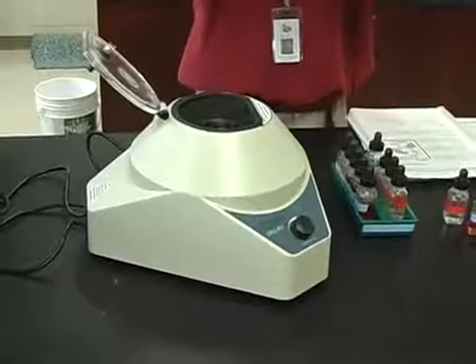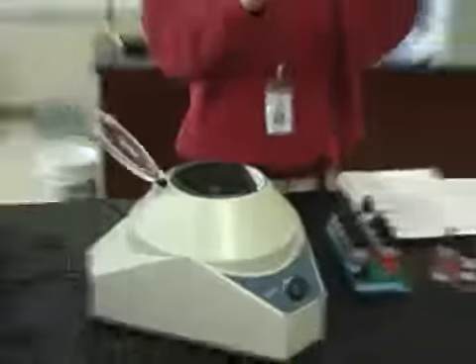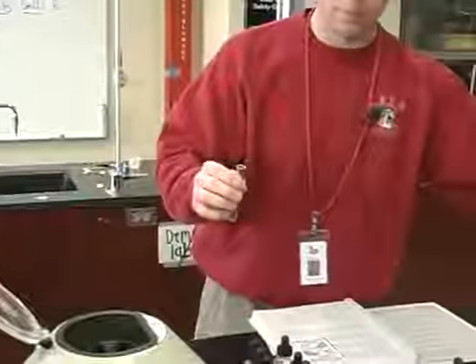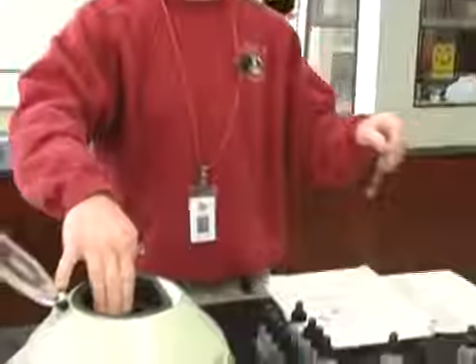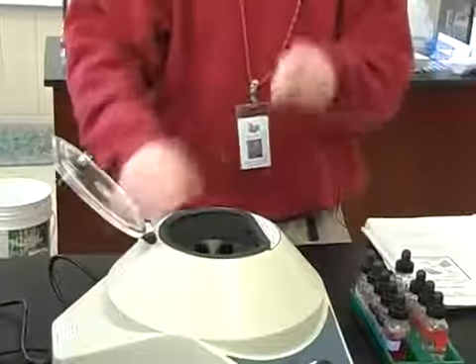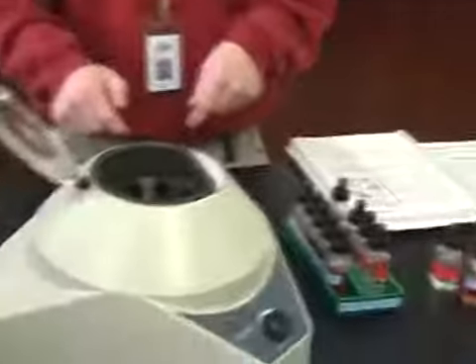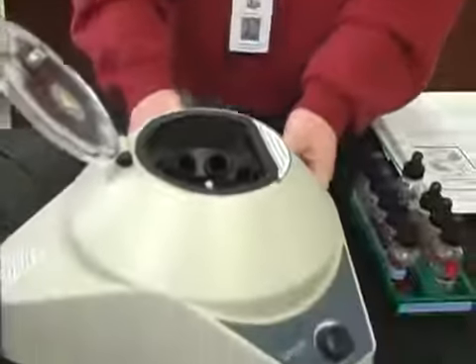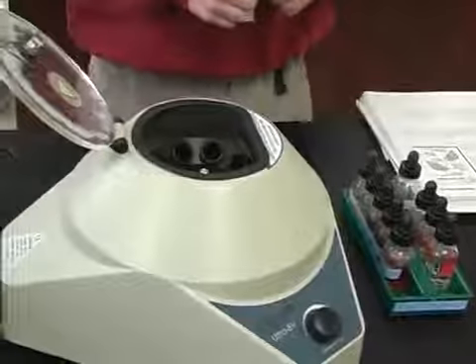And what it does is it takes the solid that might be dissolved in the solution and compacts it and brings it down to the bottom of the test tube. When you load a centrifuge, it's really important that the centrifuge is balanced. If the spinning part of the centrifuge is unbalanced, then it'll start to wobble and sometimes, in some cases, actually start to kind of walk across the table. And of course, that's not a very safe situation.